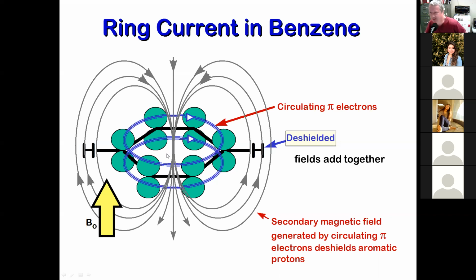Imagine, oh, it's a weird benzene, there's protons in the middle. They would be shielded, right? But the protons on the outside are de-shielded. And de-shielded is to the left. And not only is it to the left, it's extremely to the left in this case, which is 7 ppm. That is why a benzene has the protons really far to the left, 7 ppm.